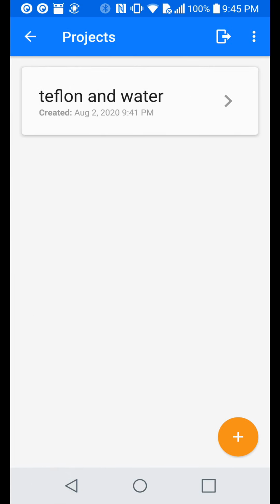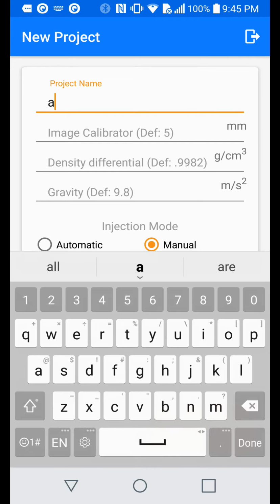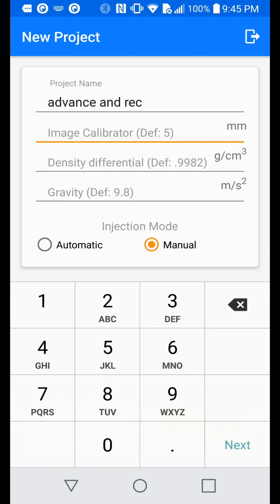We will now do a measurement of the advancing and receding contact angle. Note, the previous measurements were static contact angle measurements. The contact angle can be anywhere between the advancing and receding contact angle. So to define a surface properly, it is recommended to always report the advancing and receding contact angles.